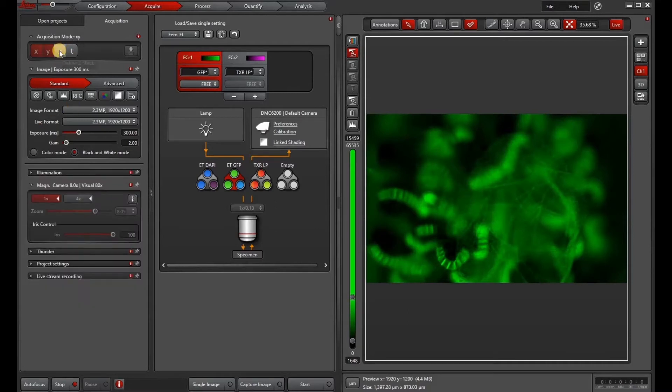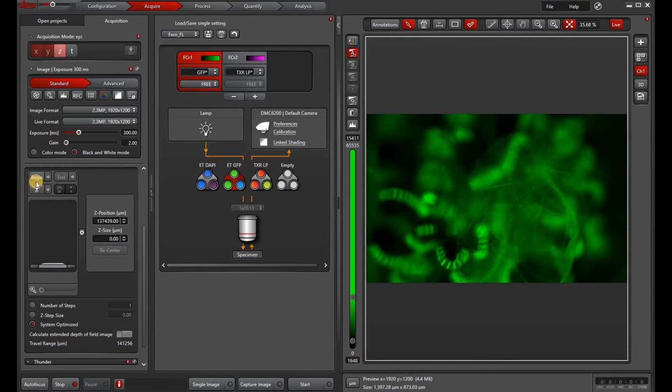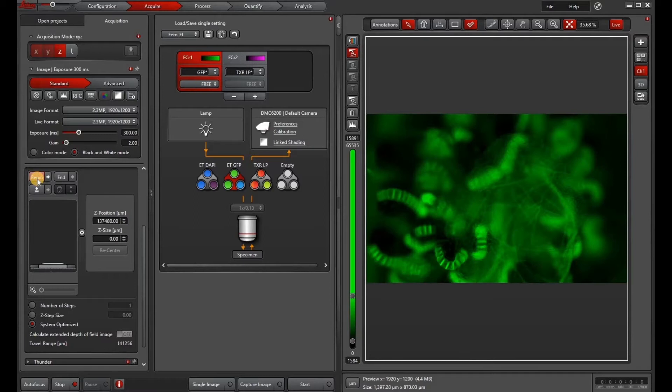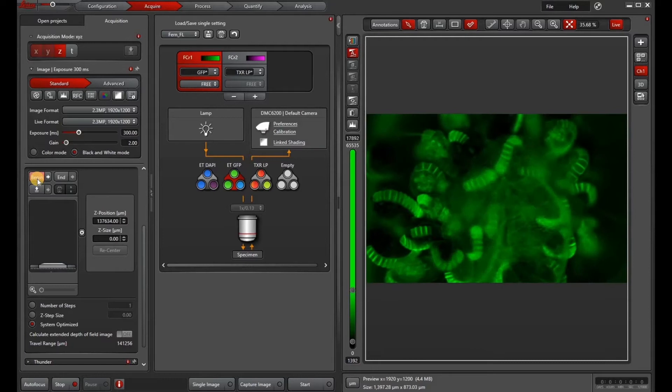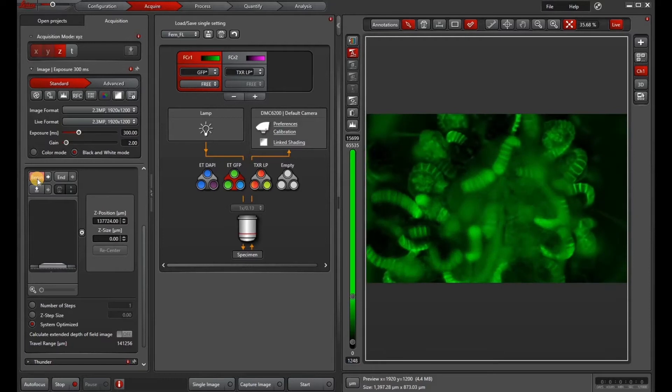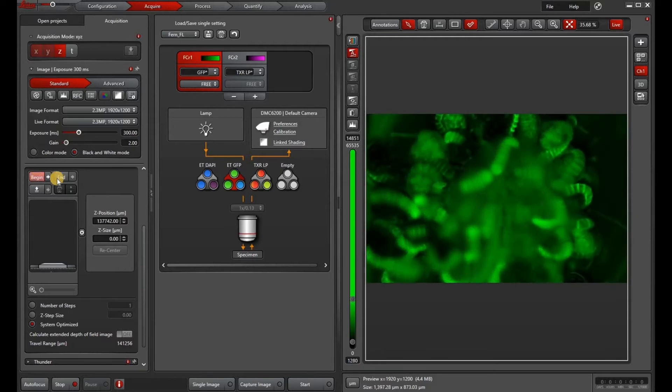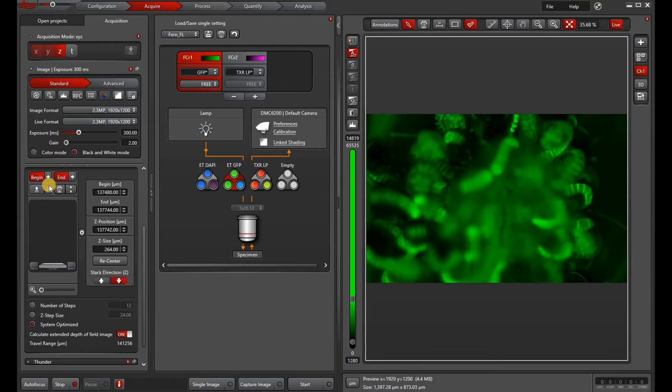The first thing you want to do is select the z-stack option at the top. That will open a window in which you can go ahead and focus to the top of your z-stack and then hit begin, then focus through to the bottom of your z-stack and hit end. One thing I like to do on the M205 especially is to hit the go to begin before I start my stack.